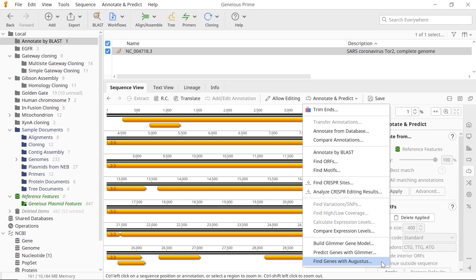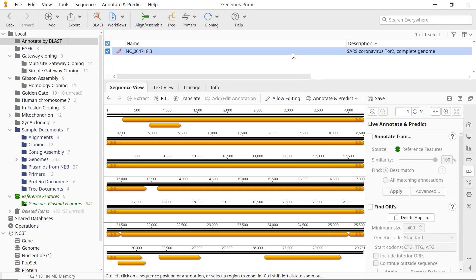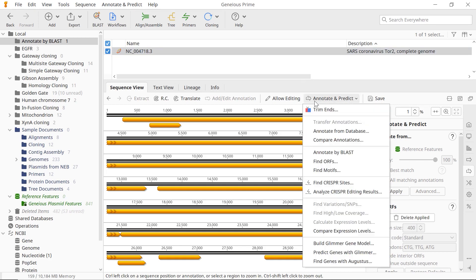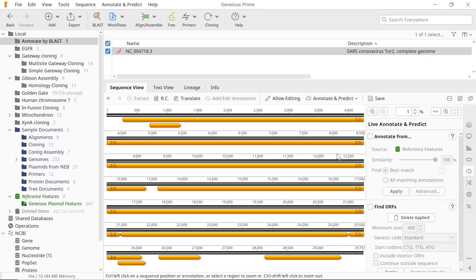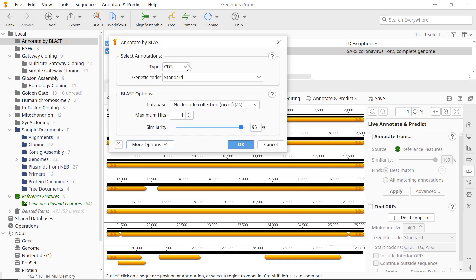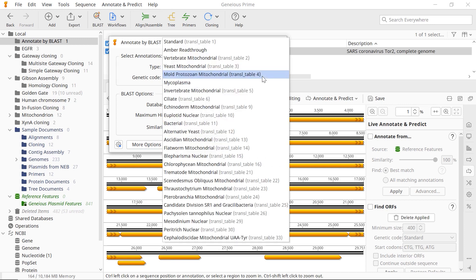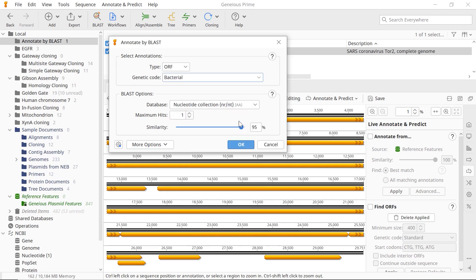Begin by selecting your nucleotide sequence and choosing the Annotate by BLAST tool under the Annotate and Predict menu. In the popup window, select the type of annotations on your sequence from the dropdown menu and set the relevant genetic code.